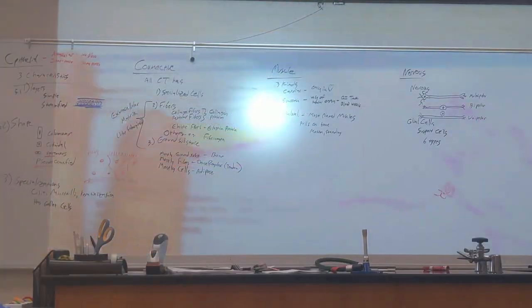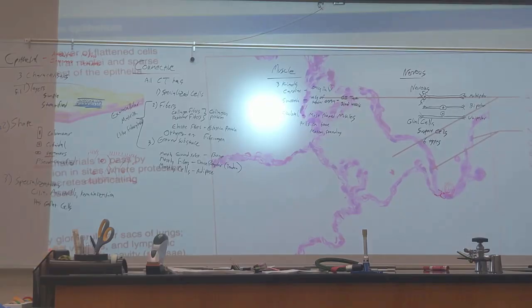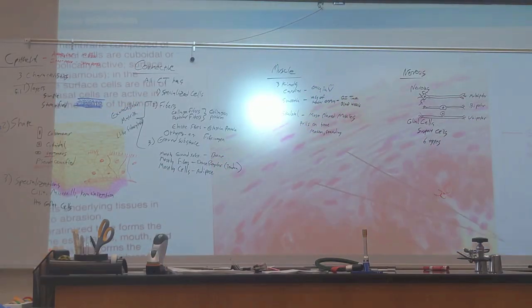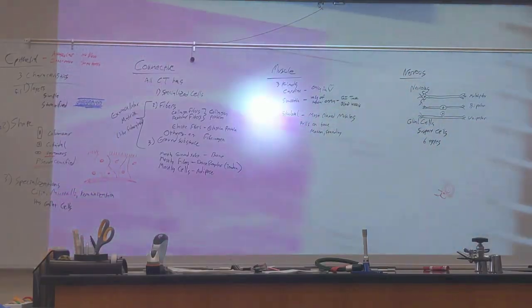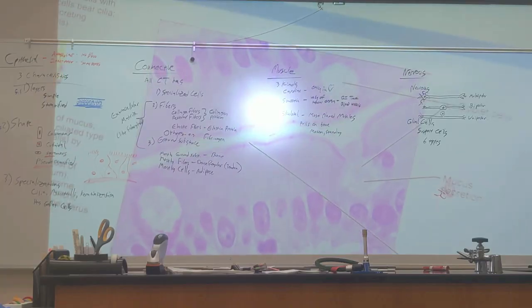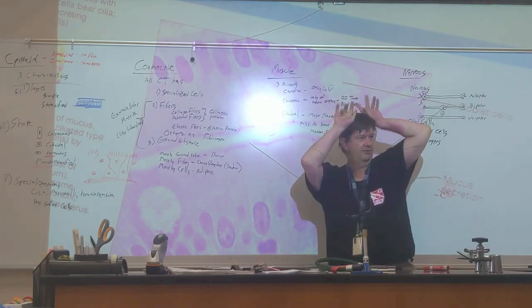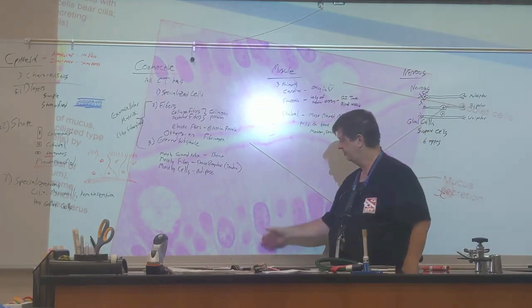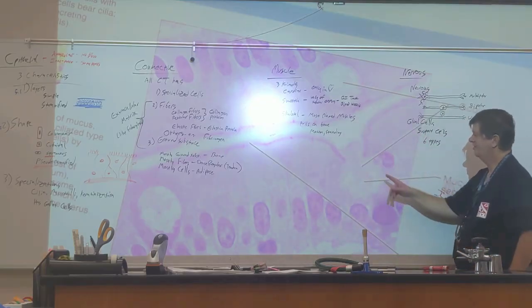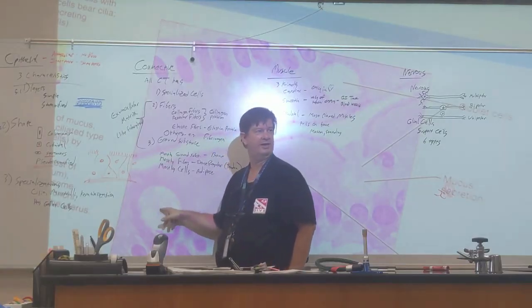So this is the old lab book's picture of simple squamous. Same thing, lung tissue. See how beautiful it is? See the little capillary? Here, this is that intestinal tissue. It's not zoomed in as much as the pretty pictures or the drawings, but this is that brush border made out of the microvilli for absorption. Good. It is simple columnar, but it's got this light staining, but you see some granules in it. Yes.